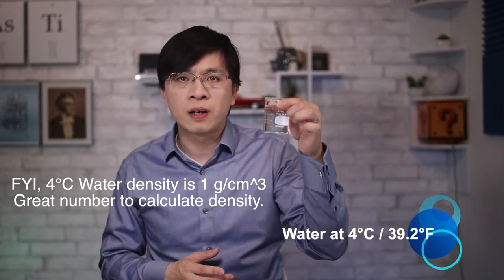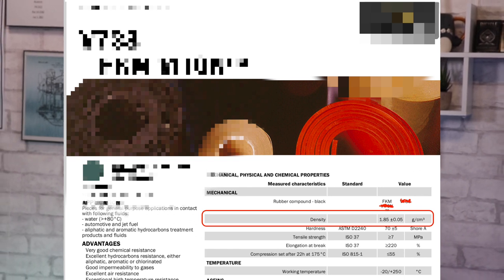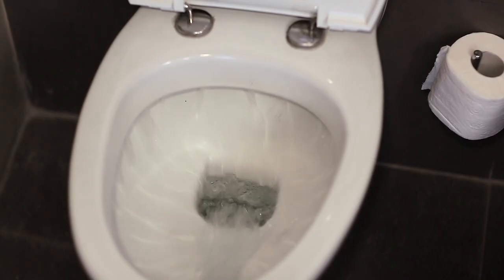The most popular reference substance is water at 4 degrees Celsius or 39.2 degrees Fahrenheit, which we are going to use today. Specific gravity of different rubber materials can be slightly different, so most manufacturers disclose this information as public references. It is the best method to identify rubber material and is considered the most cost-effective and available approach. The most common specific gravity values are: nitrile rubber around 1.1, fluoroelastomer around 1.8, EPDM around 1.2, and silicone around 1.3. Leave the water bottle in the fridge overnight to get it close to 4°C or 39°F. Tap water or any available water will do the job — it does not need to be ultra-pure deionized water.